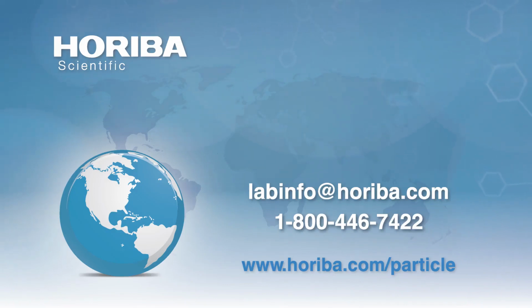When you start getting up to larger size aggregates, if you get up to 50, 80 nanometers, that's where we can start doing the counting and sizing analysis for these aggregates. So when you say medium size, I'm assuming you mean under 40 nanometers, and that's why I led with a no. That said, DLS will work well in that size range, but does not give you really useful concentration information. Thank you for the thorough answer.